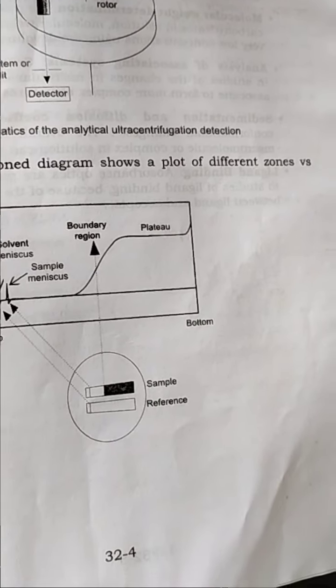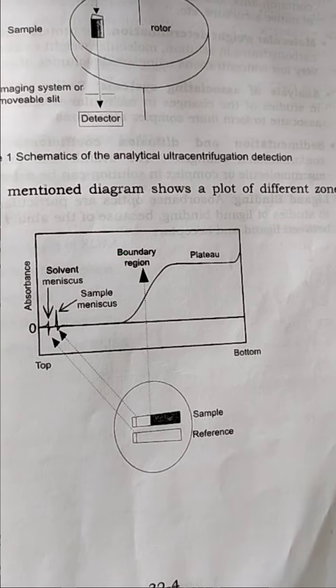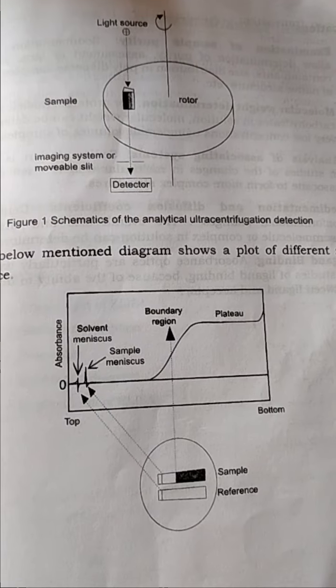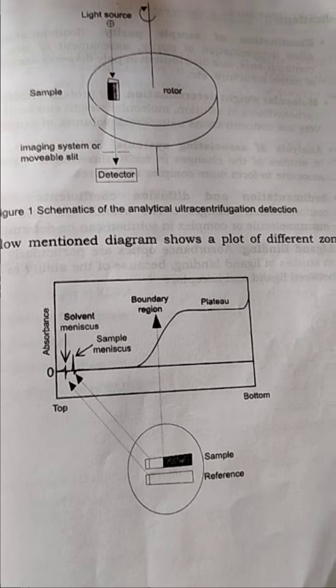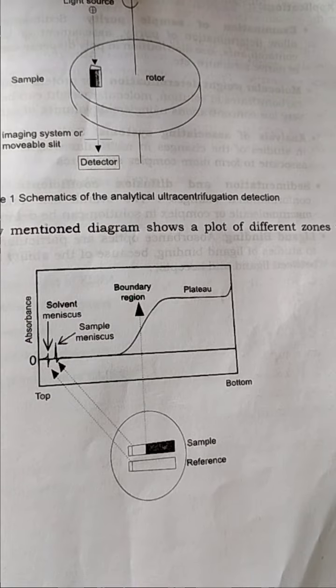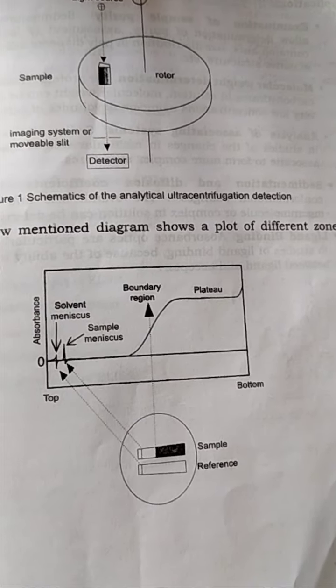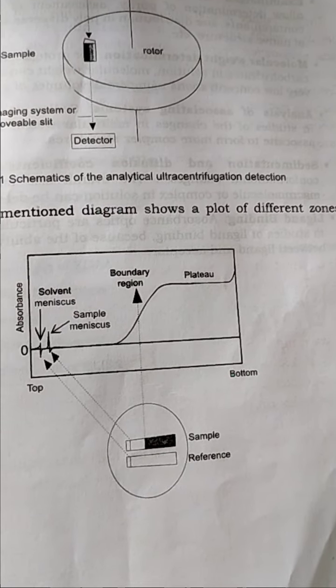Sedimentation equilibrium methods require only small sample sizes having low concentrations. The sedimentation depends upon the size and shape of the protein. The sedimentation process is governed by three factors: gravitational force, buoyancy, and hydrodynamic friction.